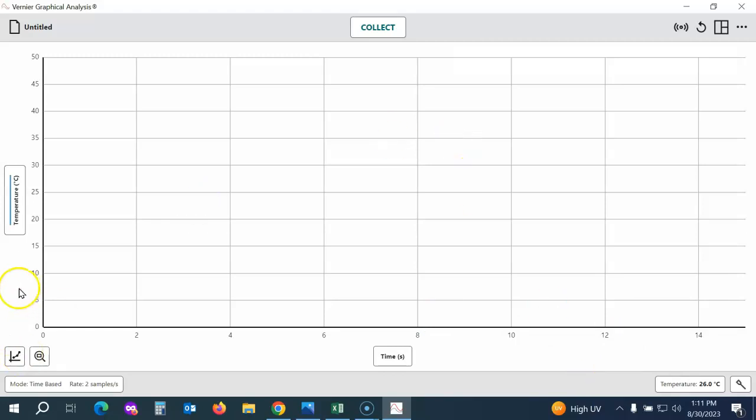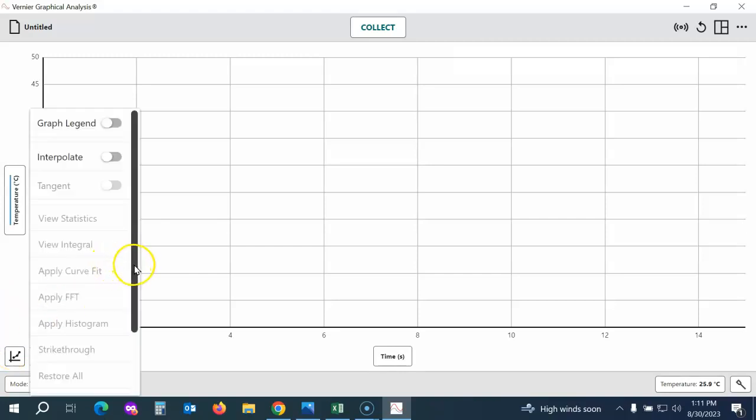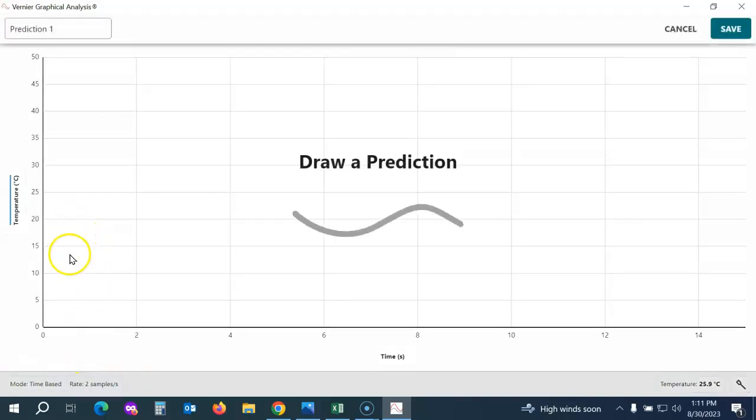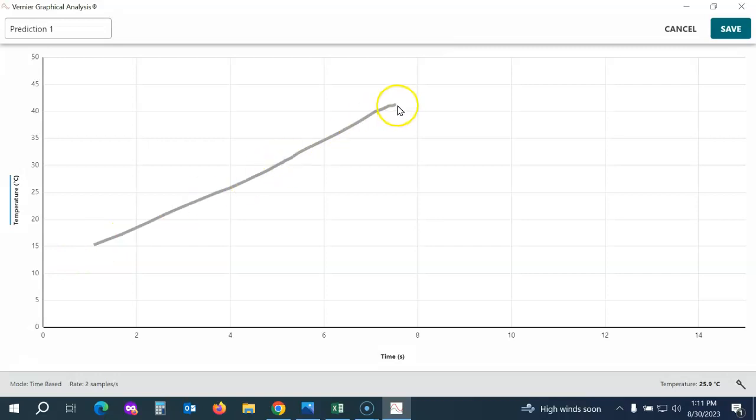Before we collect data, we can also draw a prediction. If you'd like to get your students thinking about what the resulting graph might look like, click down in the lower left corner, go to Graph Options, scroll to the bottom, and choose Add a Prediction. Students can draw a line to make their prediction. Once they've made their prediction, they can hit Save or cancel and redo it.